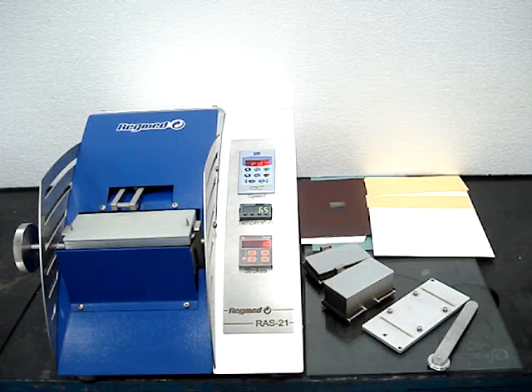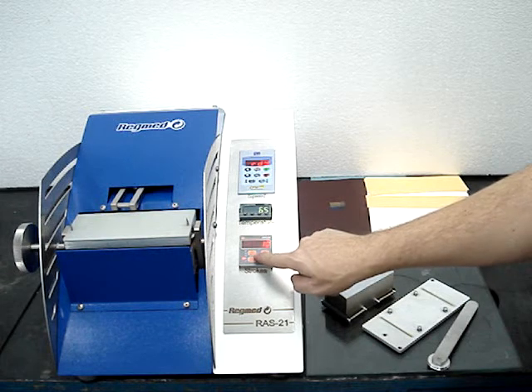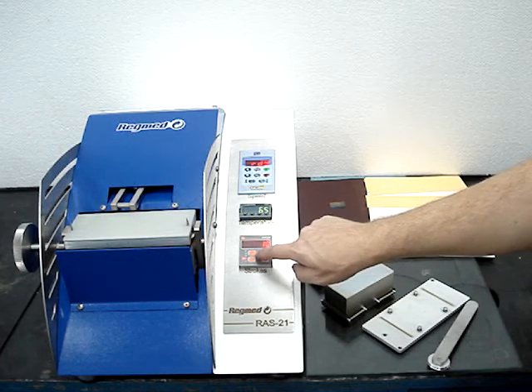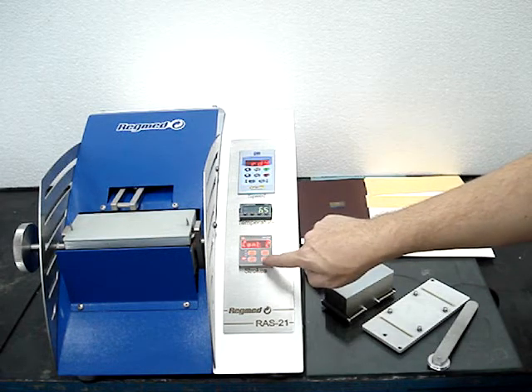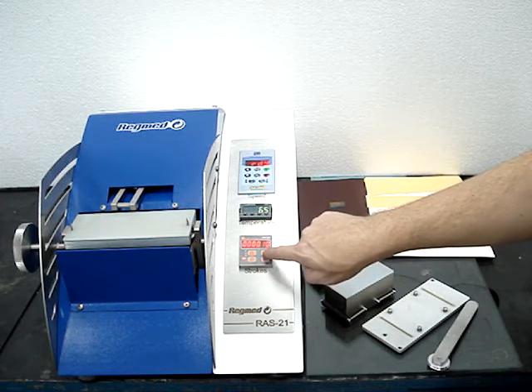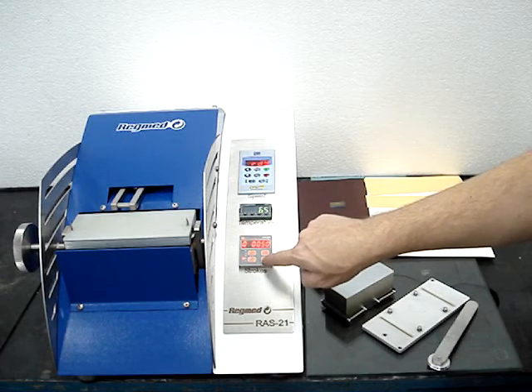Then you must set up the number of strokes desired for a test. Press on the stroke counter the number of desired strokes. Press key P and adjust properly the number of strokes desired.